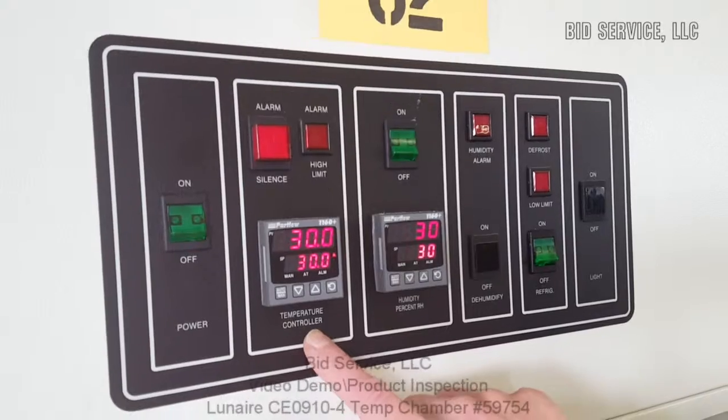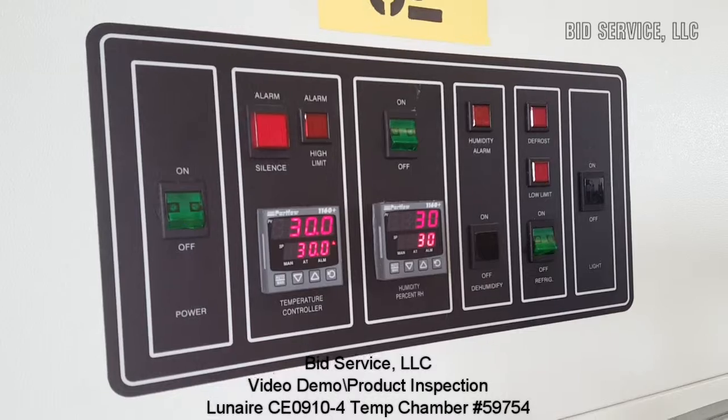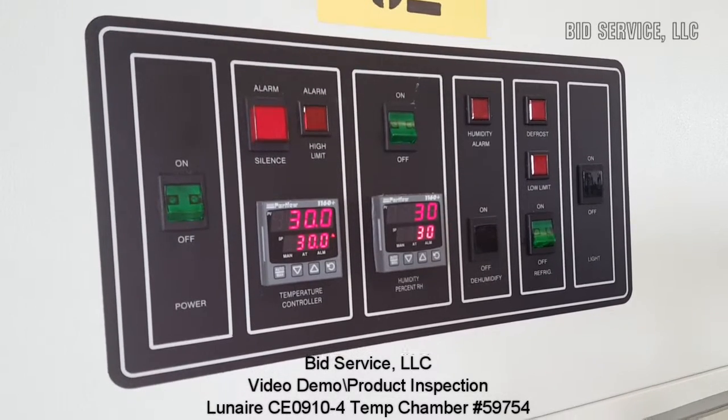Here now we're at a temperature of 30 degrees Celsius, controlling at 30% relative humidity.